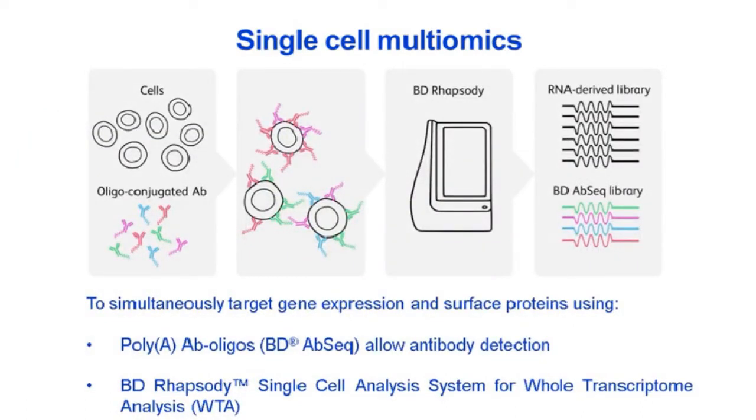So as I mentioned in the previous slide, in order to identify the molecular or genetic signature of those cells, we adopted an approach that utilized single-cell technology, and specifically a multiomics approach. Multiomics here stands for the possibility to take different measurements from each individual cell. And in this particular case, we are measuring the transcriptomics, so the mRNA within the cell, as well as protein expression on the surface of those cells.